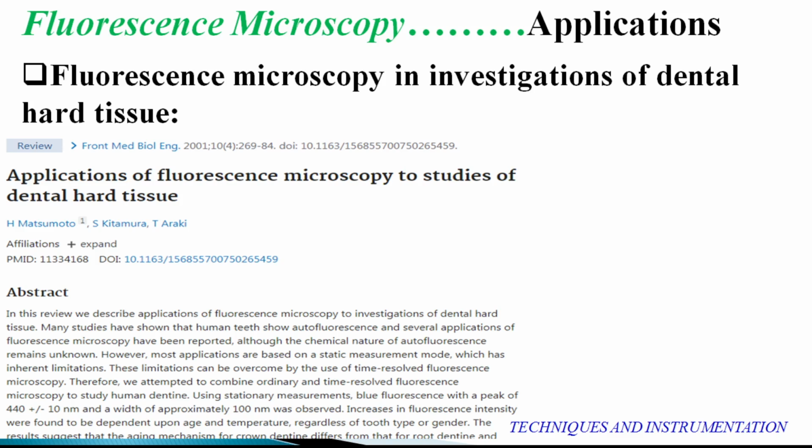So this is one of the important advantages of the technique or instrumentation known as fluorescence microscopy. So my dear friends, we were talking about fluorescence microscopy, and this is what we had discussed so far. I hope that you understood this entire mechanism, and if you still have certain doubts or difficulty, you can ask me also. This is related to the very first sub chapter under instrumentation and technique from unit number 4. I will take certain queries.